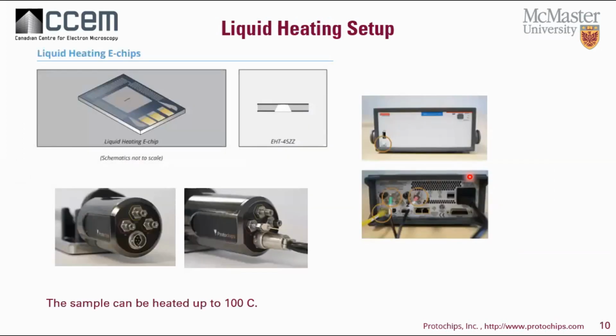In the liquid heating setup, actually, the large chip is the one which controls the functionality, allowing heating and electrochemistry in the same holder. Heating chips contain a metal heater that contacts the electrodes which are included in the holder. The sample can be heated up to 100 C.